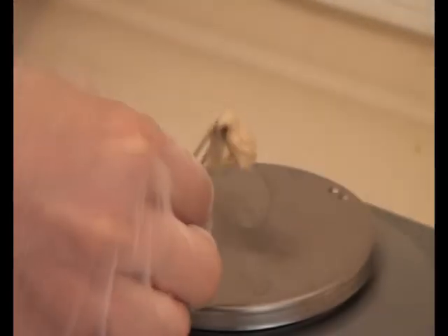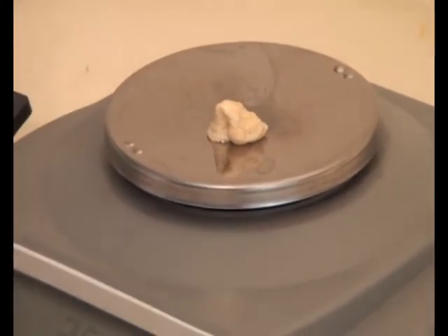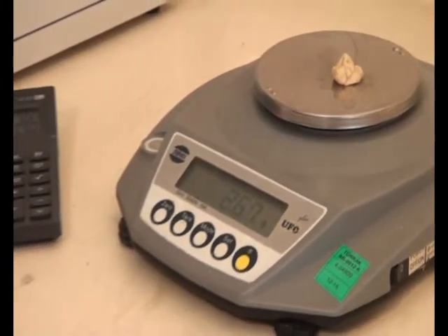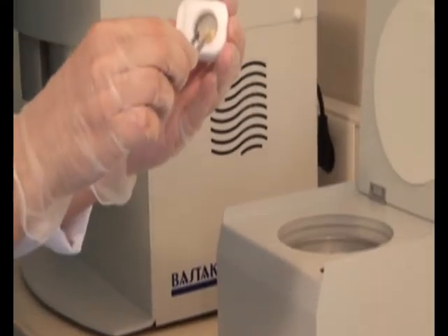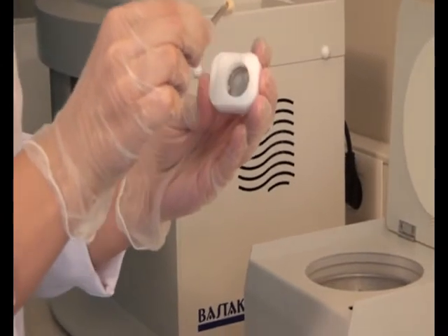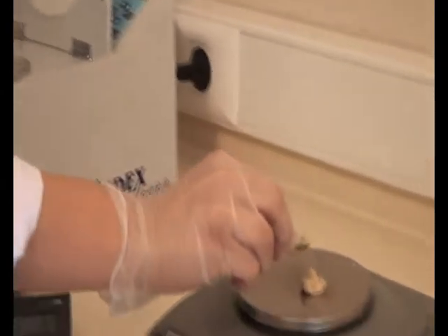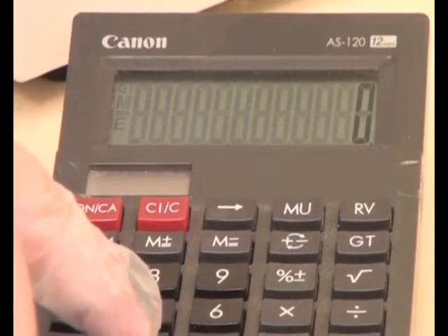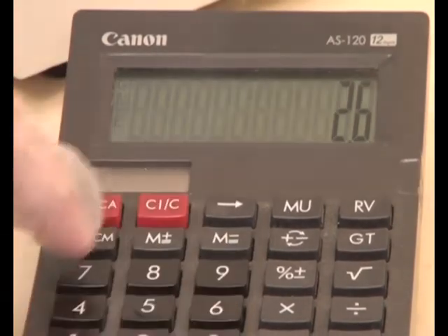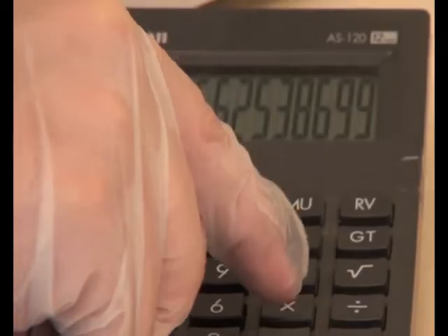Weigh each portion and note the weight. The weight of total gluten is recorded. Then, strong gluten divided by total gluten and multiplied by 100 gives the gluten index value.